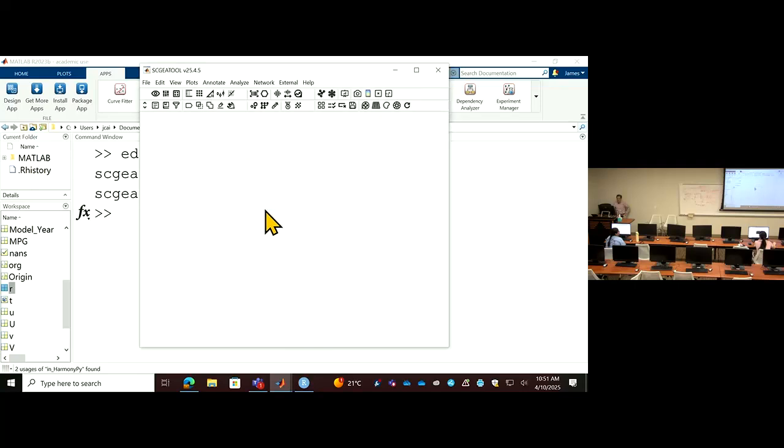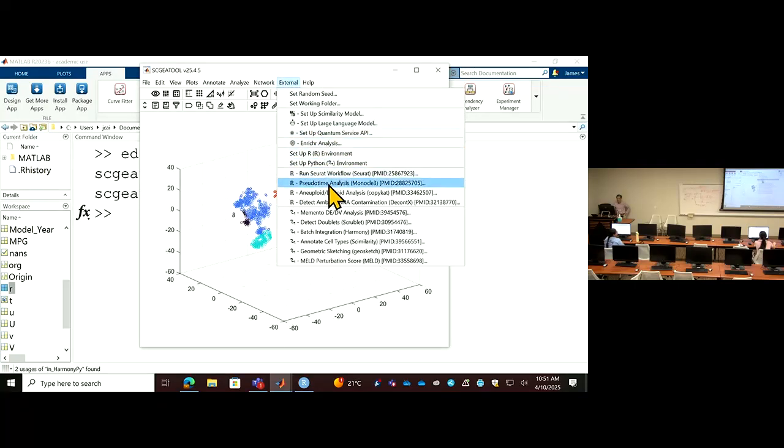Let's just still load this. I was confused by harmony in Python or in R. So we do have a Python version harmony here. So forget about the R package. We are going to install Python and the harmony Python version.